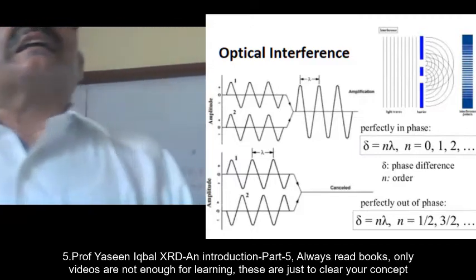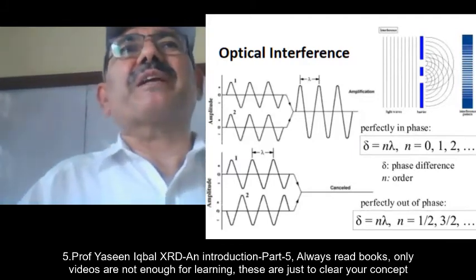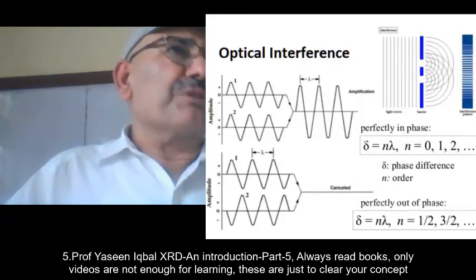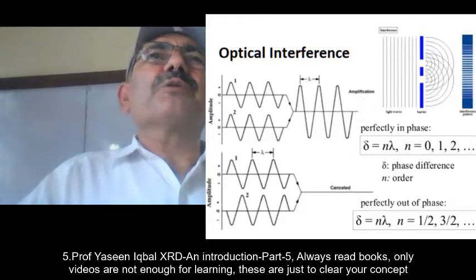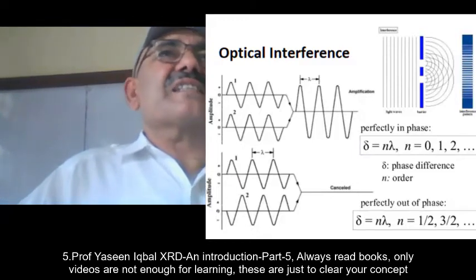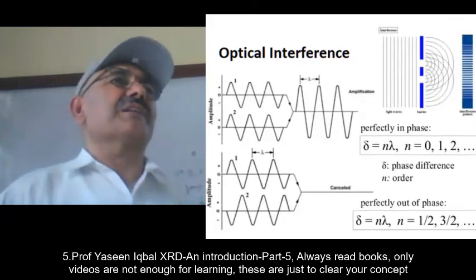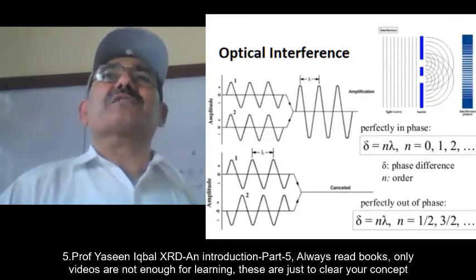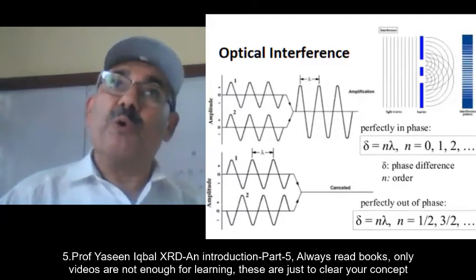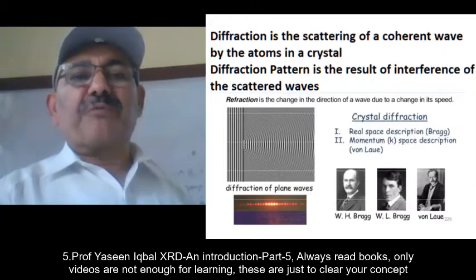So the X-ray diffraction theory is basically based on this very simple principle. If you go out of this class, at least you should have no question in mind regarding X-ray, right? Because I saw many people delete their X-ray results from their presentation, thinking that if Yaseen is sitting there, then he will ask questions. So it is the simplest thing one must know in material science, right? That is why I am going through it sequentially.